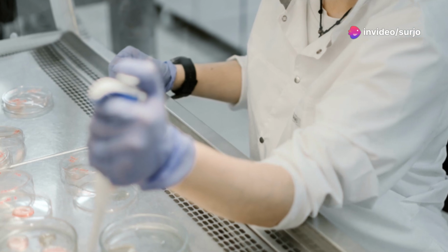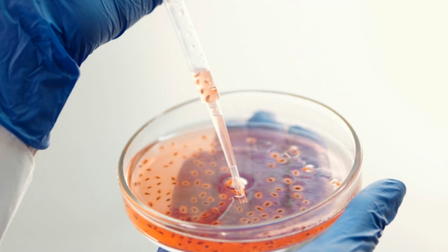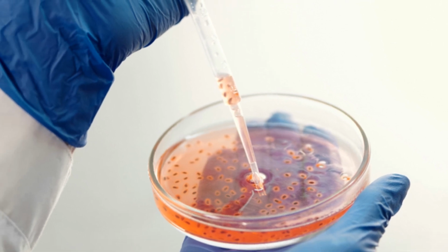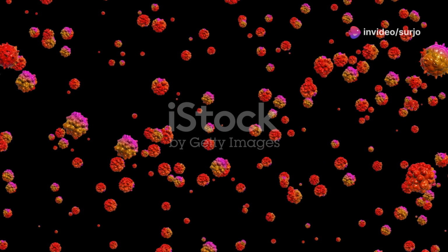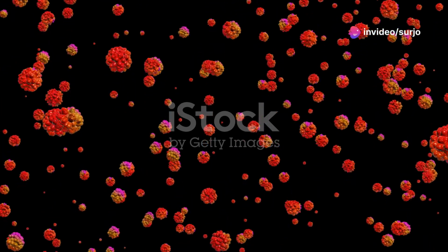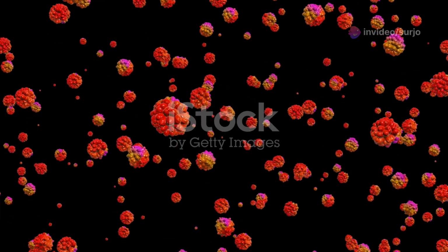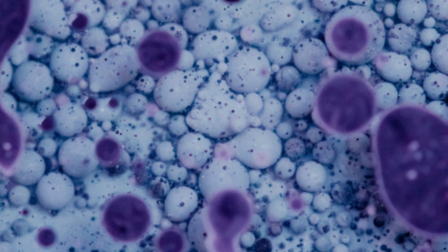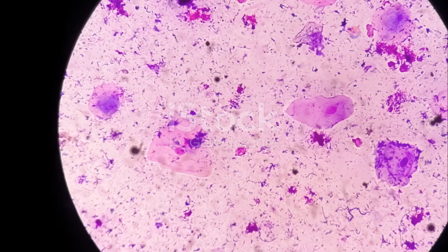The crucial step in Gram staining is decolorization, typically achieved using a mixture of alcohol and acetone. This step dissolves lipids in the outer membrane of Gram-negative bacteria, allowing the crystal violet iodine complex to leach out, effectively decolorizing them. Gram-positive bacteria, with their thick peptidoglycan layer, retain the complex, remaining purple.